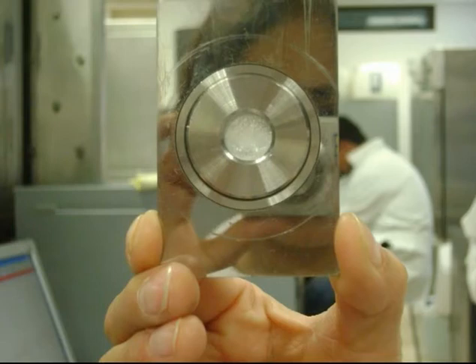To compress an excessive amount of powder requires considerably more force on the press than is required if the proper amount of powder is used, and if inordinate force is not applied to the excessive powder, the pellet will either wedge or contain white spots.